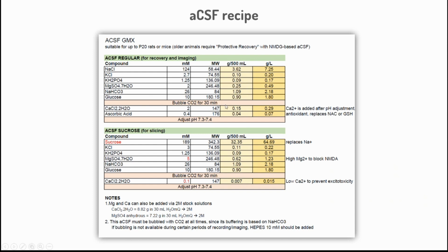This part is very variable from lab to lab. This is a recipe we use. If you search in Google for ACSF acute slices, you will find very similar recipes.